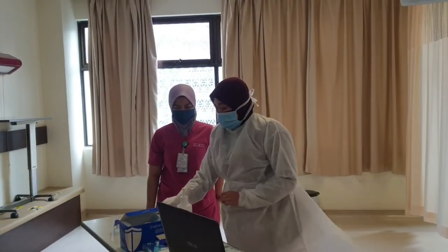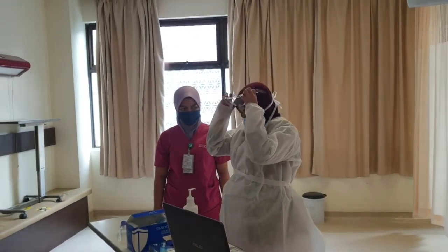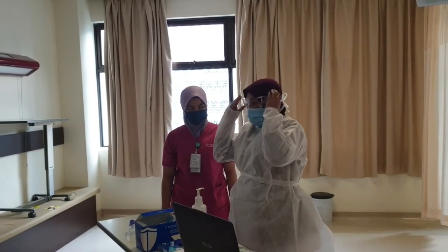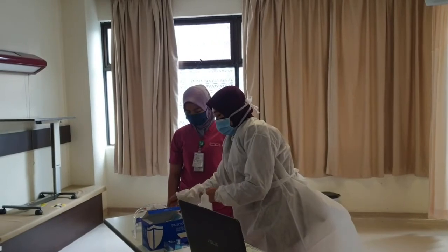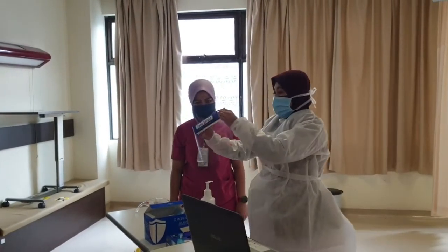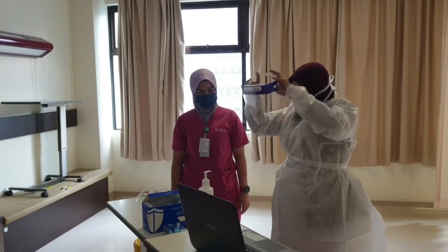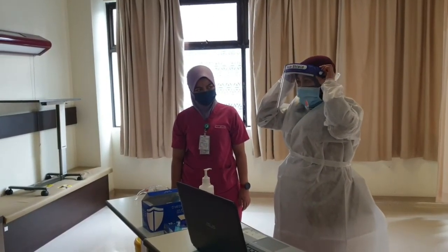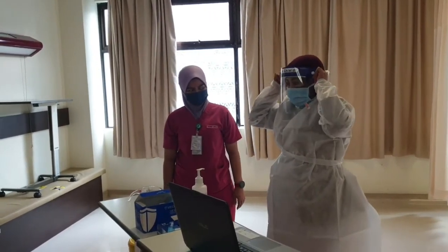So now, goggles: either you use these, which must also cover fully, or you can use a face shield. For the face shield, you also need to have the strap go straight from behind the head and adjust it to the eyebrow.